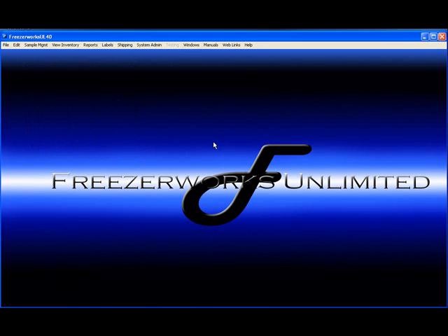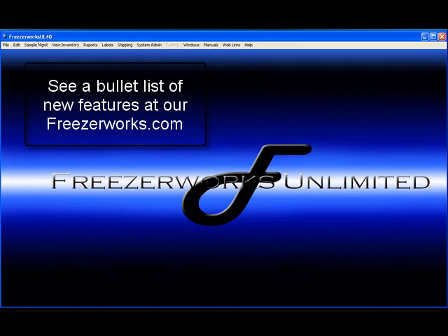Our new version will be released at the end of October 2008, and we'll go through some of the new features so you'll get an idea of what you have to look forward to as you upgrade to Freezerworks Unlimited 4.0.